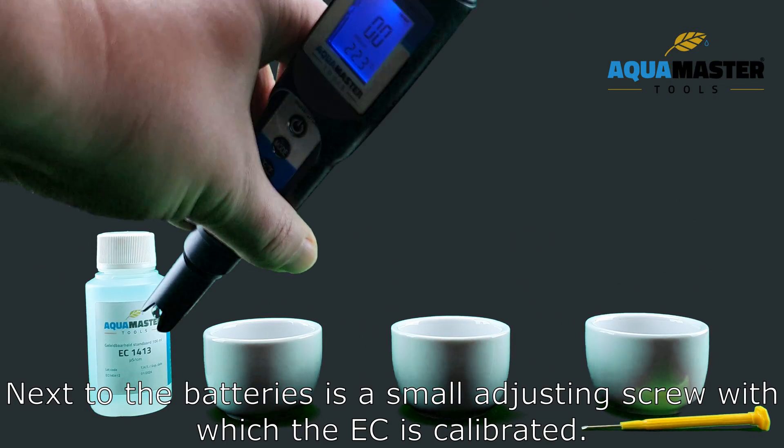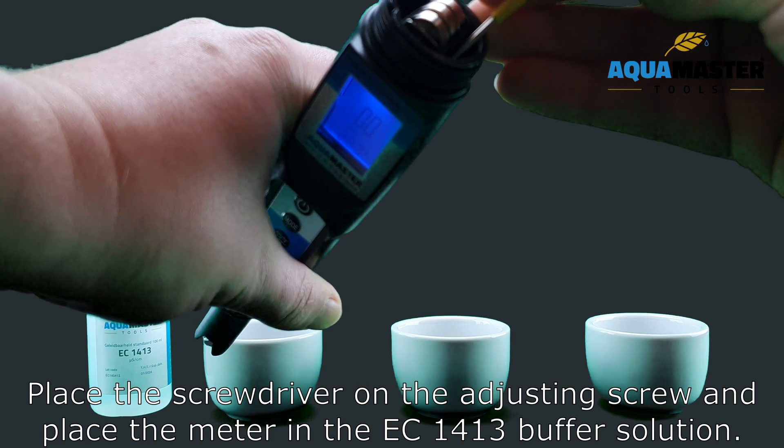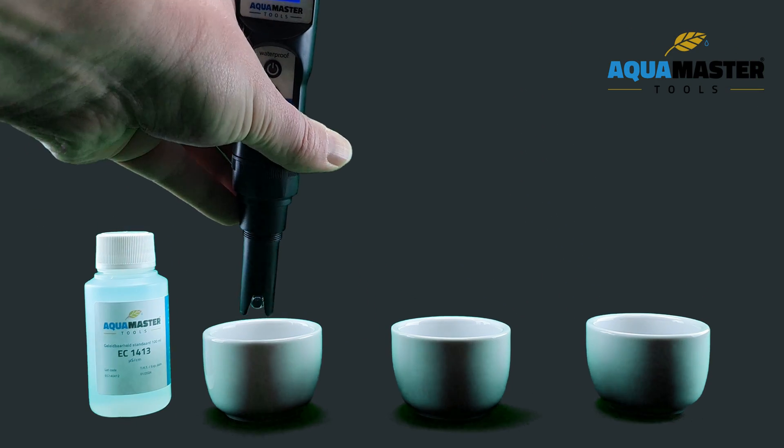Next to the batteries is a small adjusting screw with which the EC is calibrated. Place the screwdriver on the adjusting screw and place the meter in the EC1413 buffer solution.